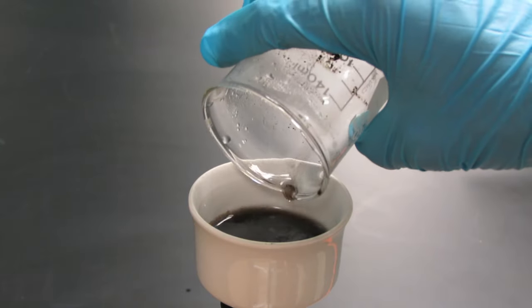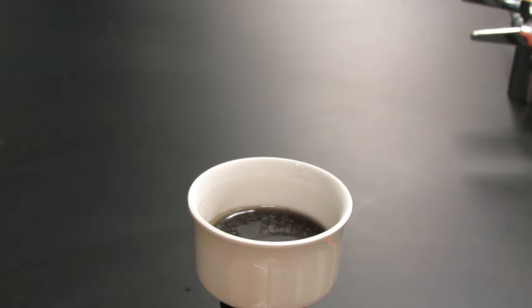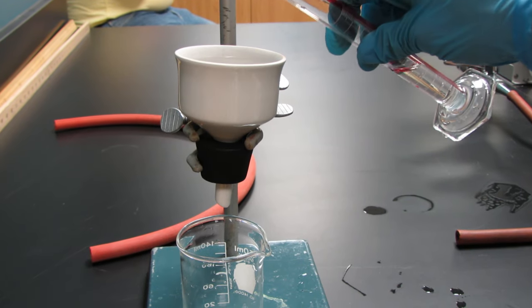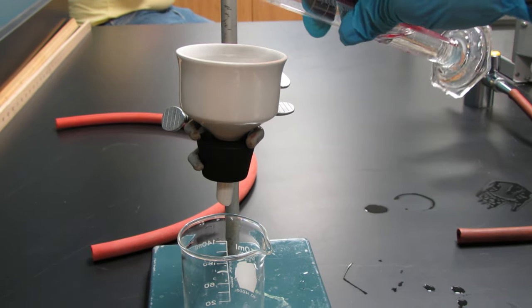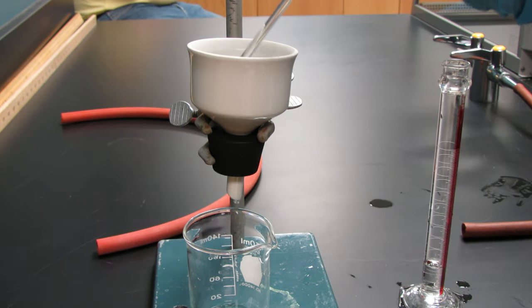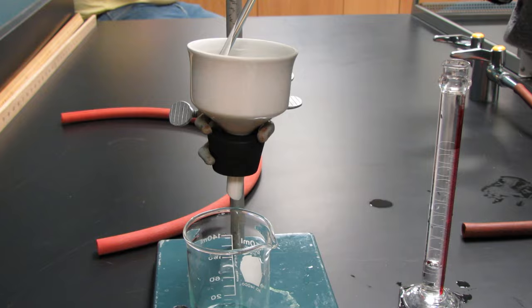Now I'm going to perform a vacuum filtration to retrieve the copper oxide. Put the Buschner funnel into a three prong clamp over a 150 milliliter beaker, and slowly add 20 milliliters of 3 molar hydrochloric acid to it. You can mix this up with a stir rod. What's happening is the copper oxide is dissolving into copper chloride.